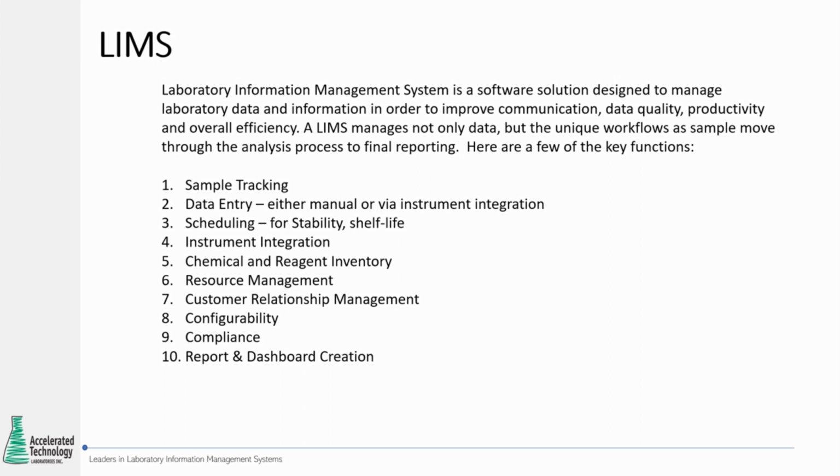Traceability is becoming very important. With ISO 17025, auditors always look for traceability in terms of the reagents, the supplies, and the chemicals that are used in the laboratory. They look at things such as the lot numbers, the expiration dates, what reagents were used with what tests. They look for certificate of analysis reports that were received when reagents were brought in-house, and with a LIMS system you can actually link a copy of those to the reagent or chemical that was logged in for quick and easy access.